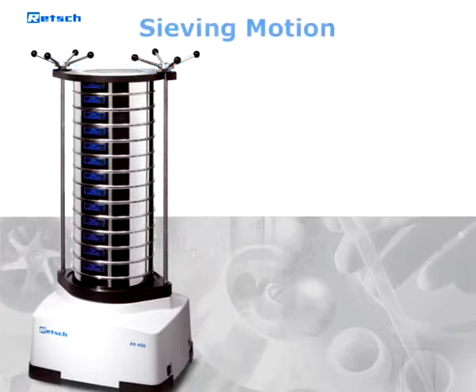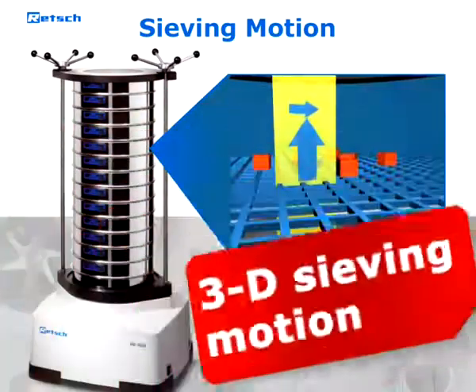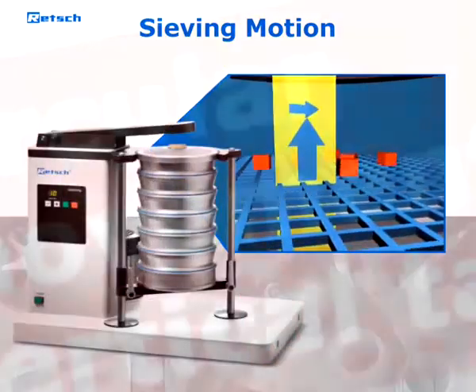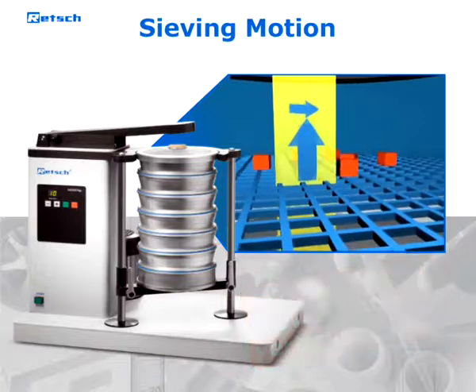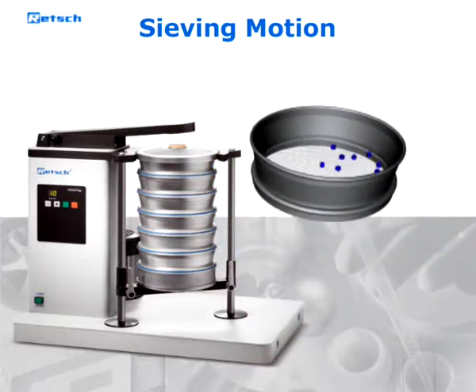Whereas most other Retsch sieve shakers let the sample move over the sieve surface through an electromagnetically induced three-dimensional throwing motion, the AS200 TAP generates this movement via a mechanical drive, creating superimposed circular movements and vertical taps. This particular sieving motion is characteristic of TAP sieve shakers.